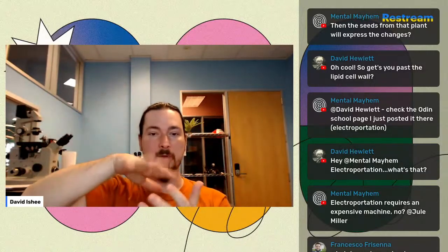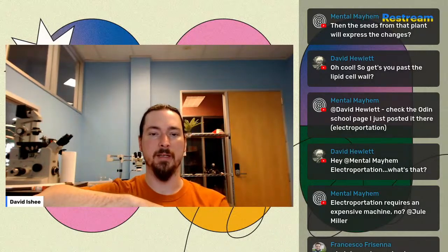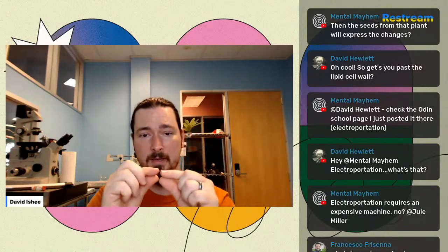So what you can do is you can take those cells, remove them, wash them off really good. Usually you have to bleach them and really clean the heck out of them, because if you get mold spores or something in there, it's going to take over your plate. It's terrible. And that's the hardest part, is keeping everything clean and trying not to get contamination, because you're going to be growing this for a very long time, months. You think about how slowly plants grow normally, then imagine you've only got a little circle of cells. It's going to take a long time for that little circle of cells to gather enough energy and resources to do anything, especially with no roots, no stem, just a little patch of leaf.